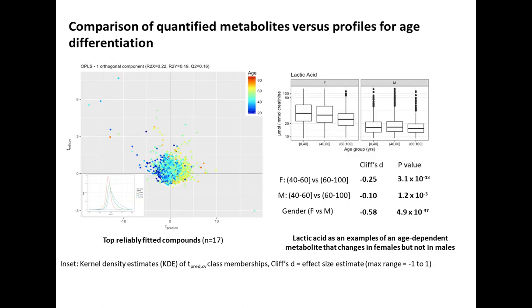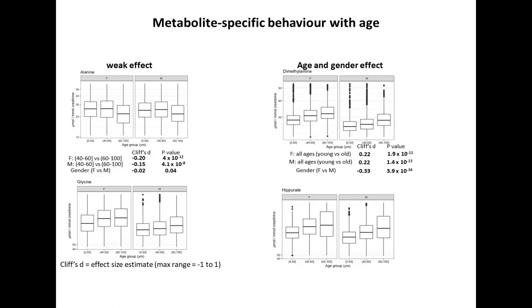We can look at the same for age, and then we can start to stratify these metabolites by age and gender. You can see for lactic acid, in females over age, the lactic acid drops in concentration in the urine, whereas for males you don't really see this effect. So we have different patterns here associated with age and gender. For the first time we've been able to establish a really comprehensive set of reference ranges for physiological variance, looking at a wide range of populations. And you see different behavior patterns for different metabolites.